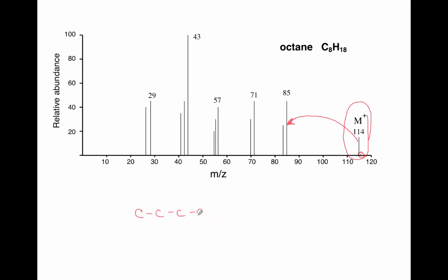Remember, I have octane. If my molecule splits here, and the positive charge goes here, that's going to be this peak at 85.